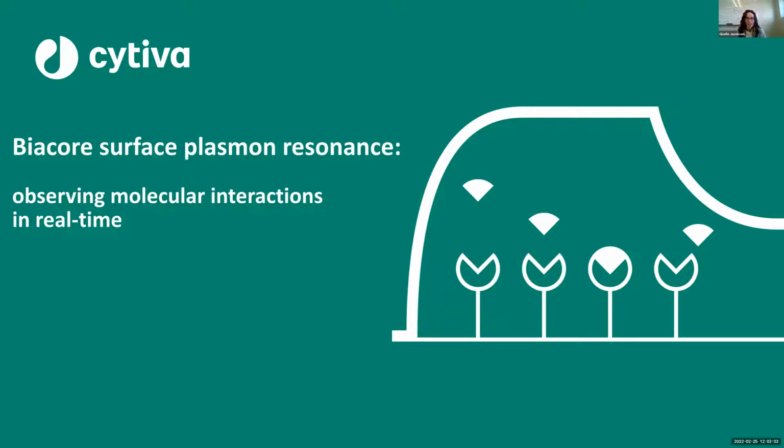I am Giselle Jacobson, the staff scientist in the Biophysics Instrumentation Core facility, or BIC facility, at the University of Notre Dame. The BIC offers instrumentation dedicated to characterizing biomolecular conformations and interactions, as well as equipment for isolating and purifying macromolecules for subsequent biophysical analysis. We currently have 13 pieces of equipment, which are available for in-person or sample mail-in usage.